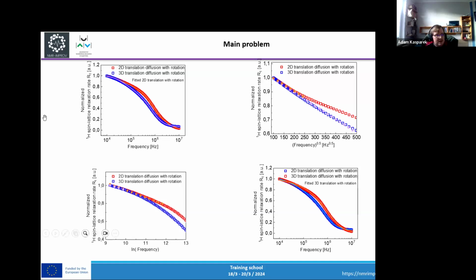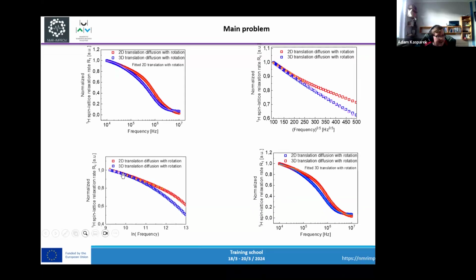Okay, we can have linearity here, but it's only on a very small area. So maybe, despite that we have this linearity, it's not actually correct. Similarly here, we have linearity, but only on a small area, so it's probably not right.